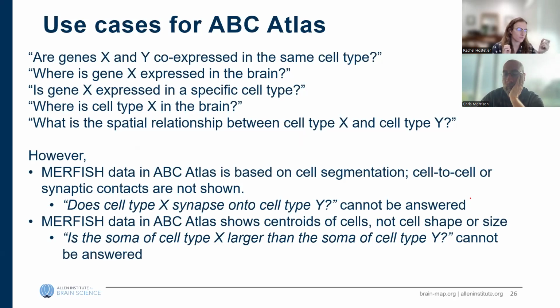We do have the raw MERFISH data that was used to create the MERFISH plots here in the ABC Atlas. So if you're interested in the raw MERFISH data, we do have that accessible on our website, and then you can see more of that. But yes, so these are some things that are currently not possible to answer with the data set and how it's set up in the ABC Atlas.